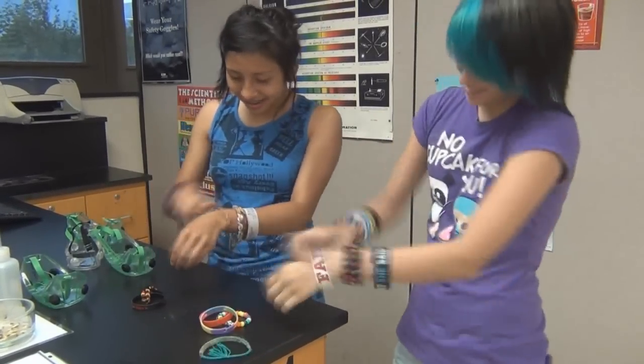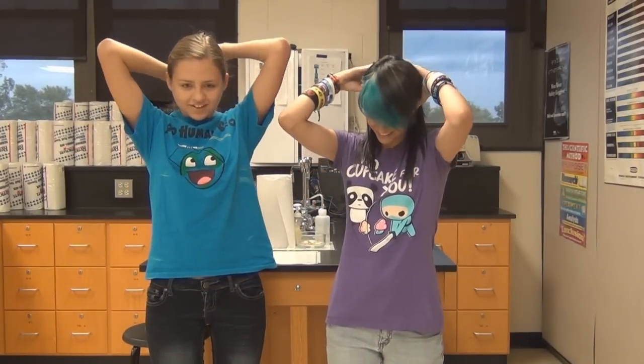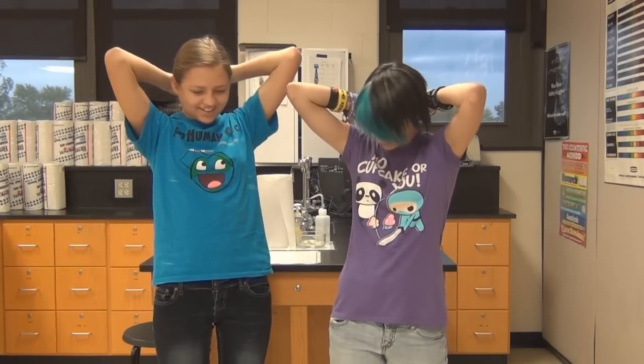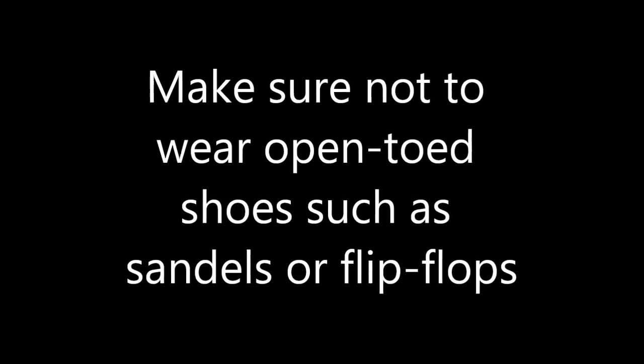First, make sure to take off all loose jewelry. Make sure your hair is tied up. Make sure not to wear open-toed shoes, such as sandals or flip-flops.